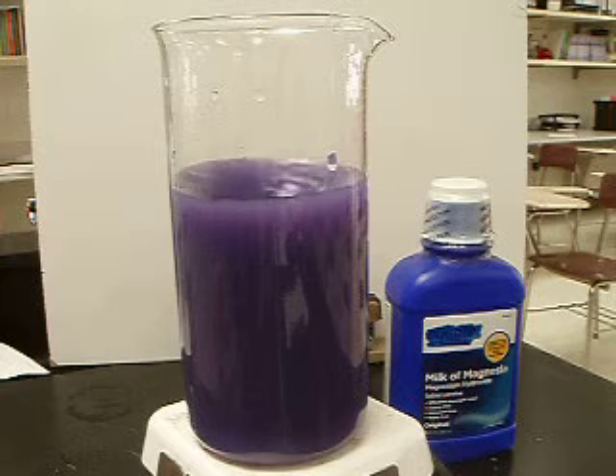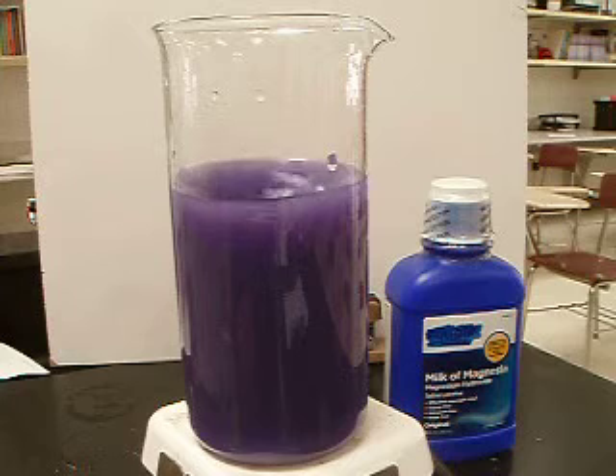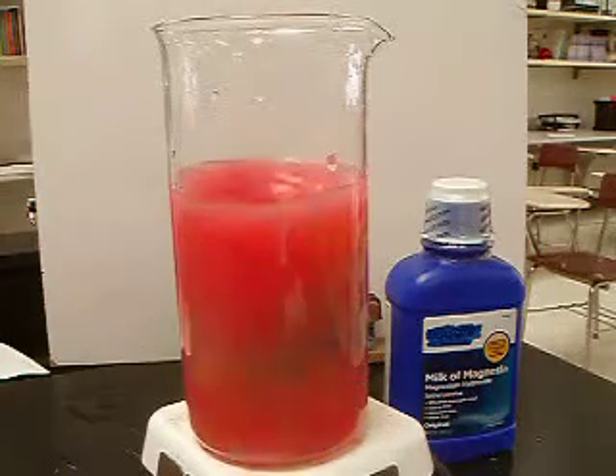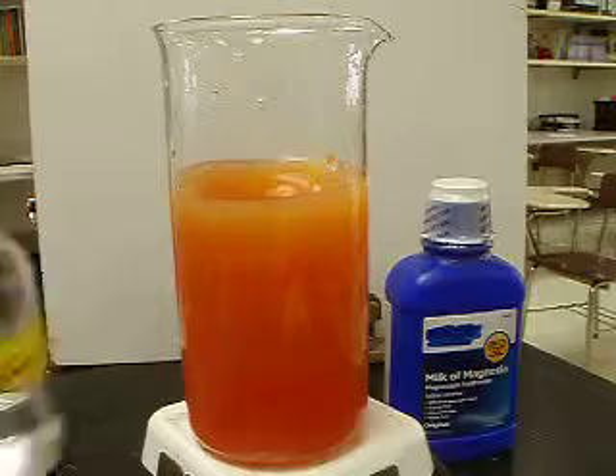You notice the pH of 14 gives you that purple color. We can change the pH of the universal indicator now by just adding a few drops of hydrochloric acid. We get a nice pink color, and that will change.